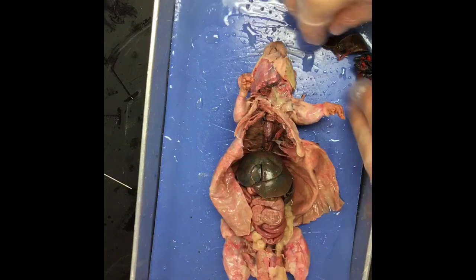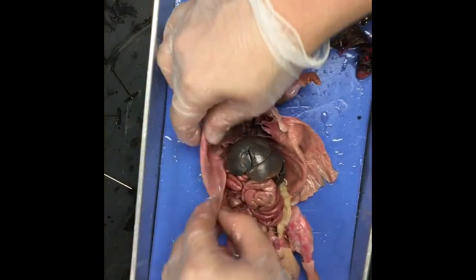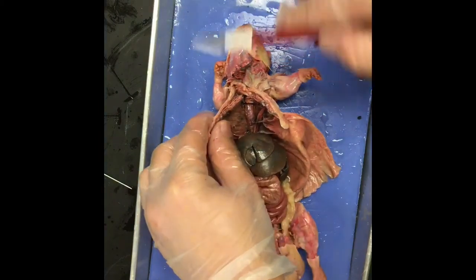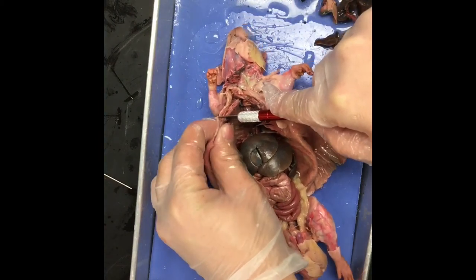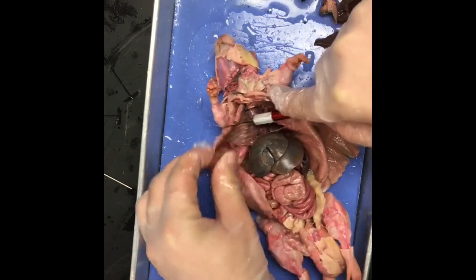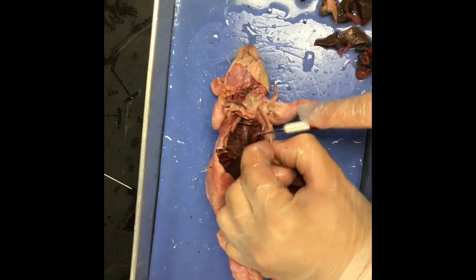I'm done. Mila, you ready? That's the heart. That's the lungs. So, next, just off to the side, the digestive system. So, what I'm going to do is I'm going to go between two of the ribs. I'm just going to go down just a little bit there, and it goes down the entire spine.